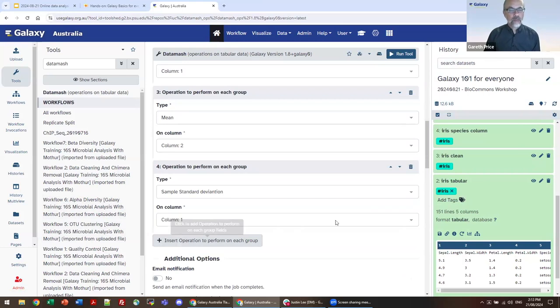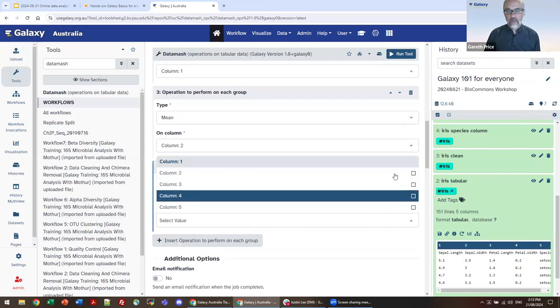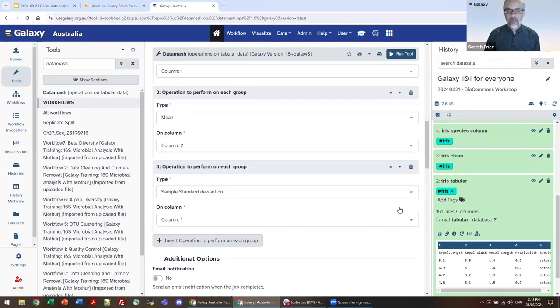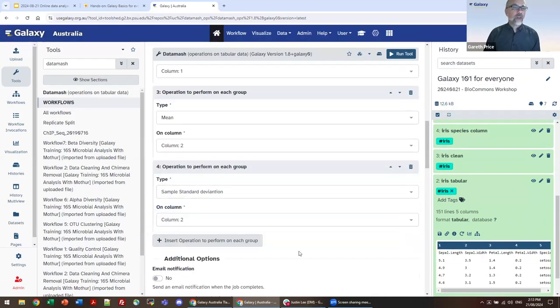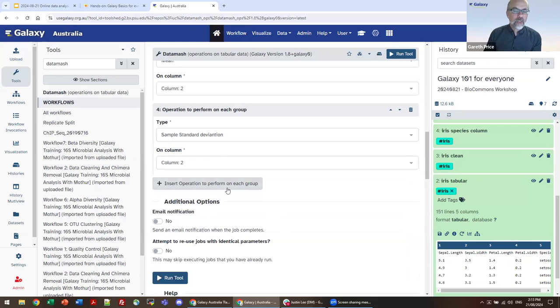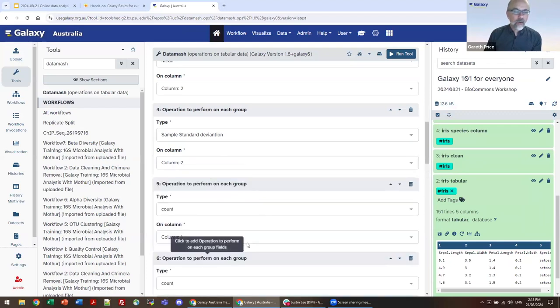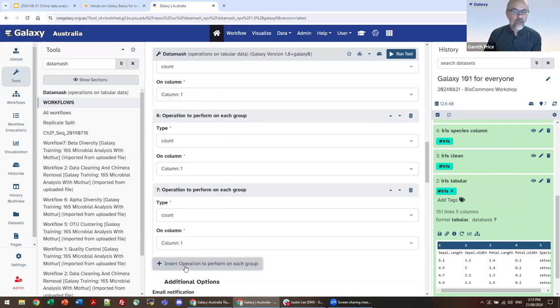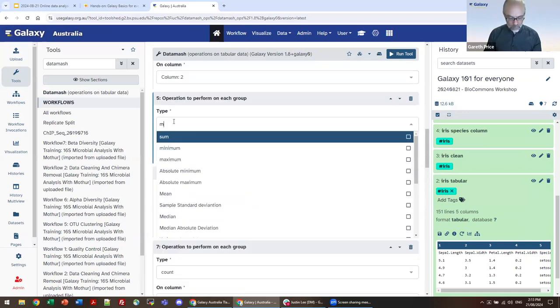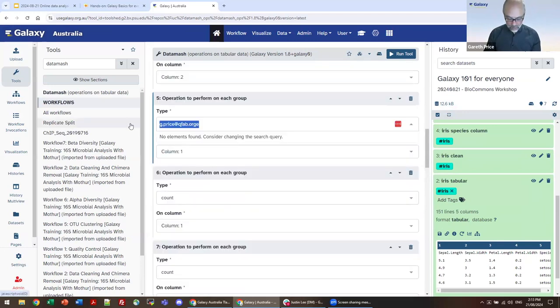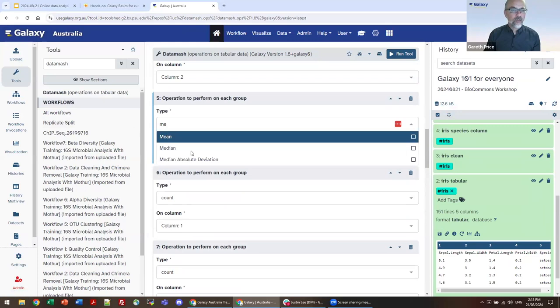There's some interruption here from a password manager — apologies. We have four columns of data and we're doing two operations on each column, so we will have eight operations in total: mean and standard deviation on column one, mean and standard deviation on column two, same again on column three, and same again on column four. You could reorder these so all the means are first and all the standard deviations later — that's the level of customization you have.